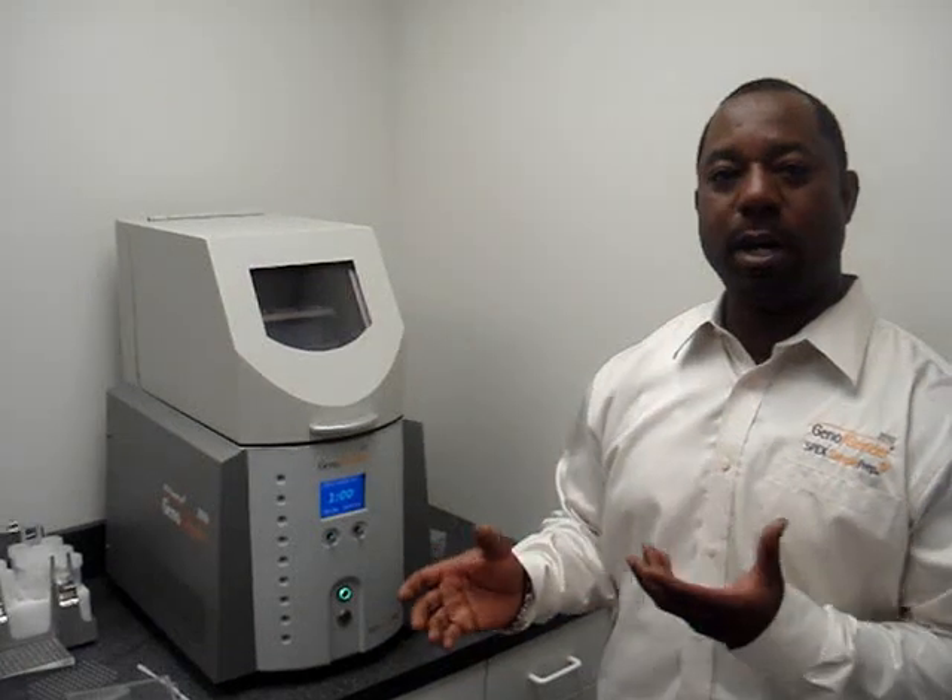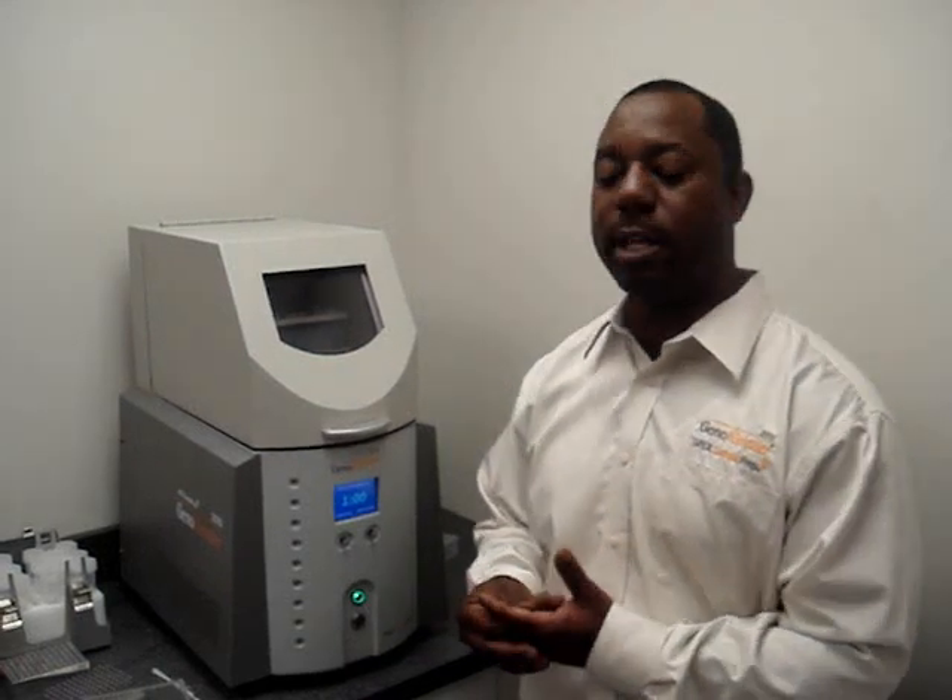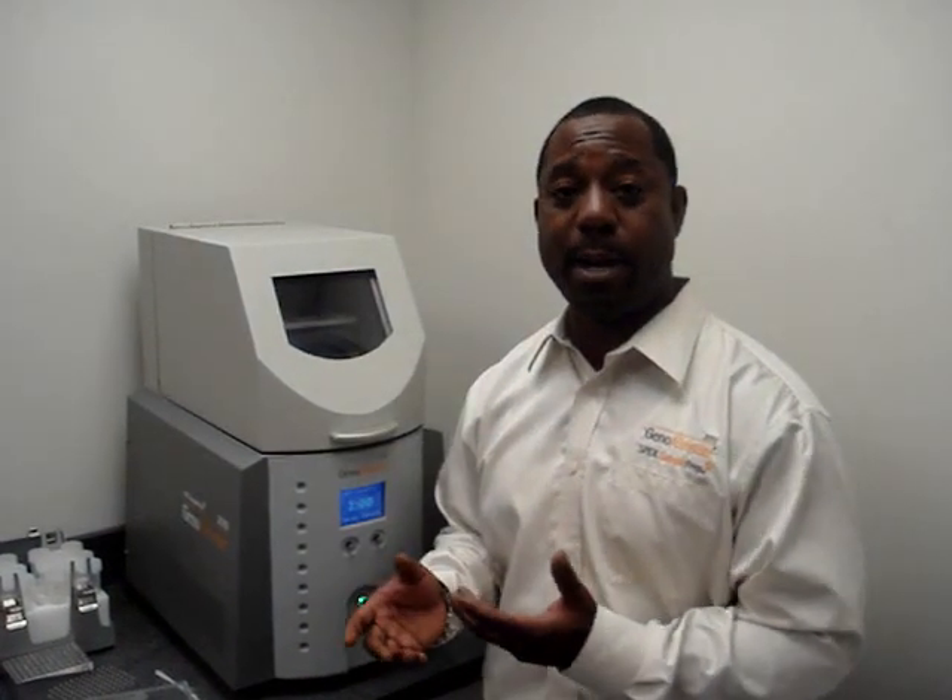Today I want to give you an overview of how flexible this particular instrument is. It actually can do anything from a 96-well format all the way up to 50 mLs in a run time on the average of one to two minutes.